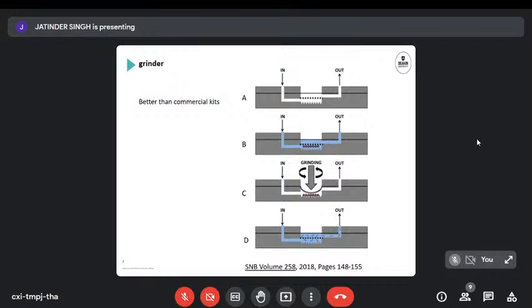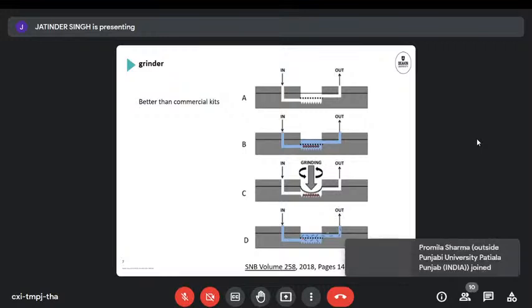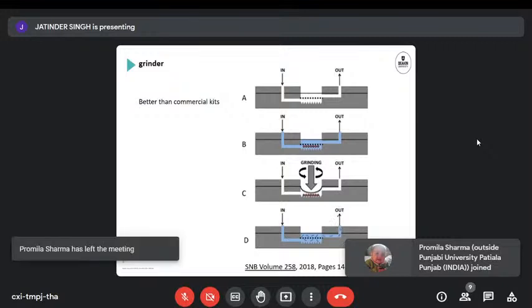This second membrane here is a membrane with a cutoff where the cells can't fit through. Depending on the cell type, they may be 10, 15 microns. So if these pores are 1 micron or smaller in diameter, the cells can't get through, but the molecules released by the cell can be collected at the outlet.